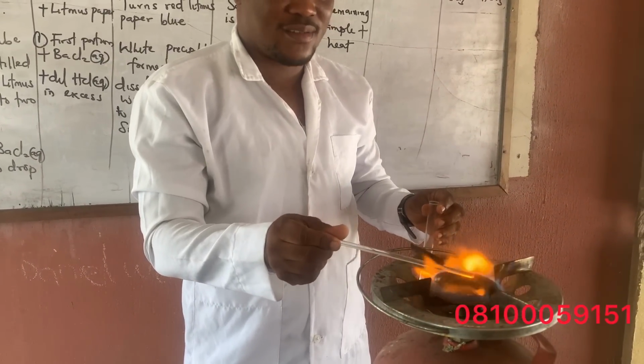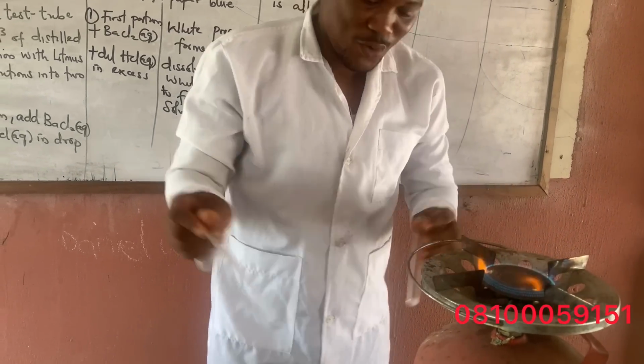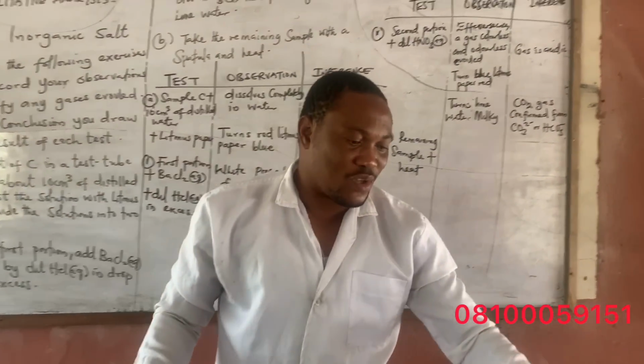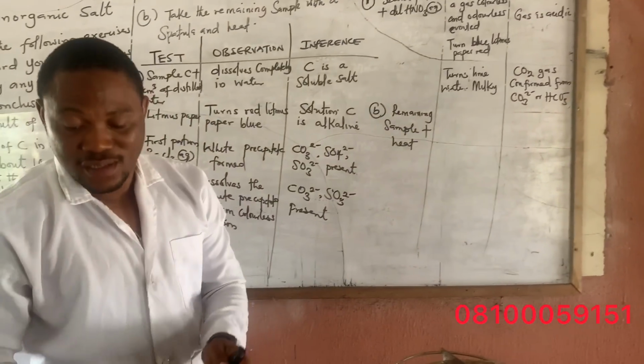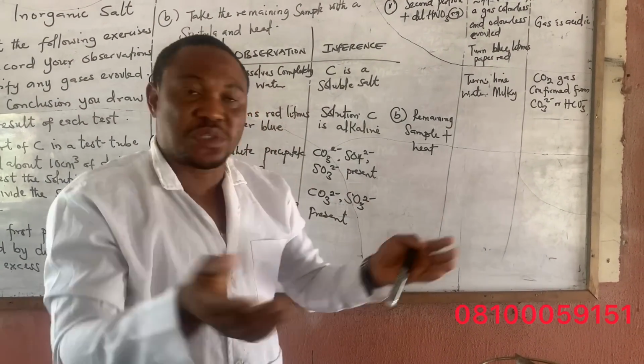Can you see that? It's still the same, still giving us the same test. So irrespective of the one they ask you to do, it's still going to give you the same result. If they ask you to dissolve this in liquid, put your glass rod and subject it to the flame, it will still give the same result.